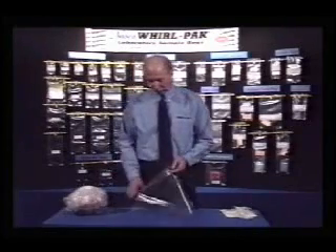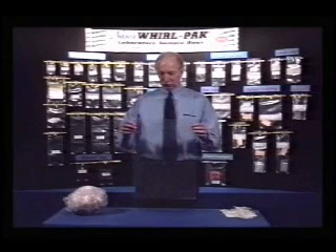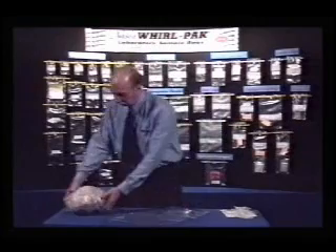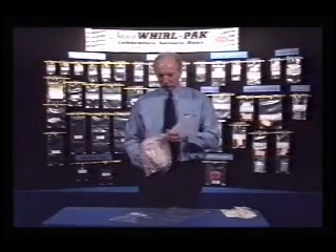NASCO offers a special sample bag for the poultry market called a poultry rinse bag, sized to hold chickens and other small poultry. It is sealed at the top and has a perforation for easy opening. After the bird has been dressed, it is placed in the bag and phosphate buffer is added.